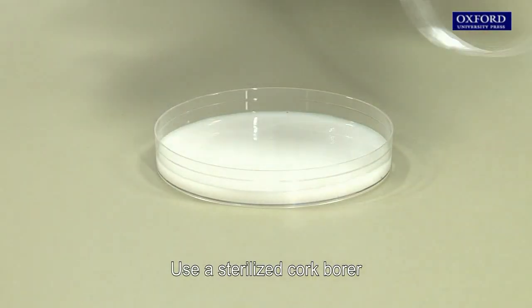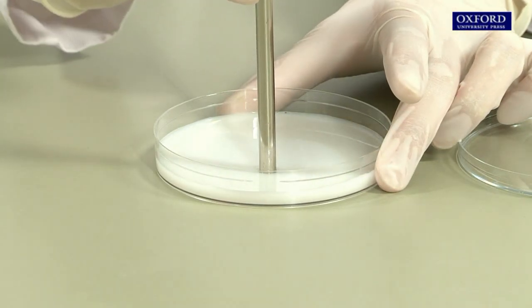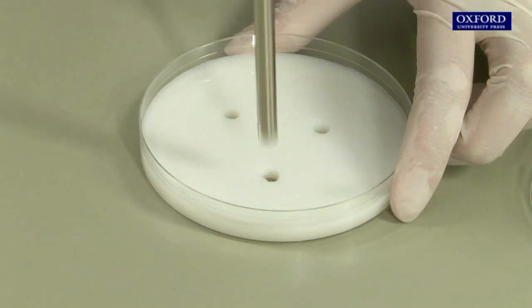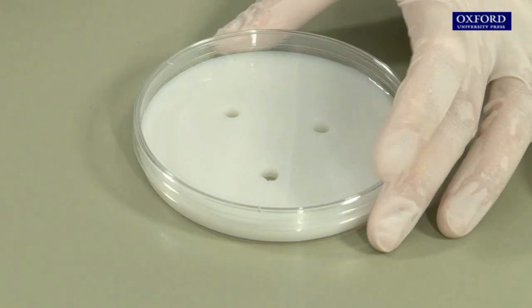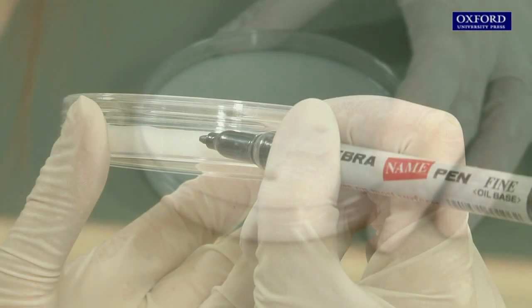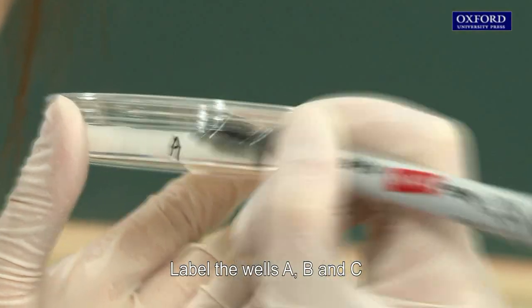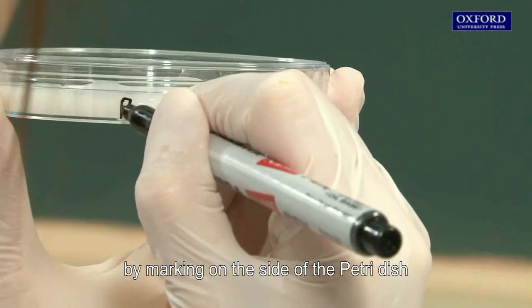Use a sterilized cork borer to make three wells in a milk agar plate, then cover the plate immediately. Label the wells A, B, and C by marking on the side of the petri dish.